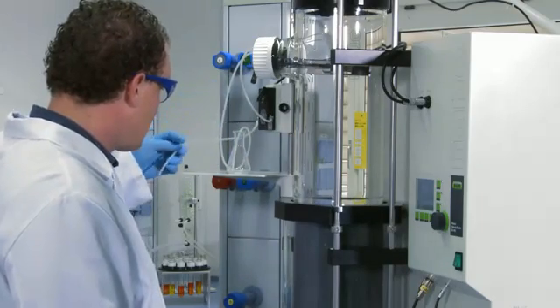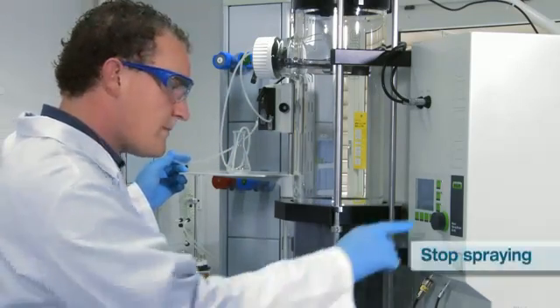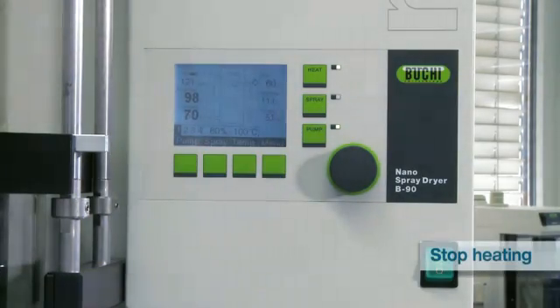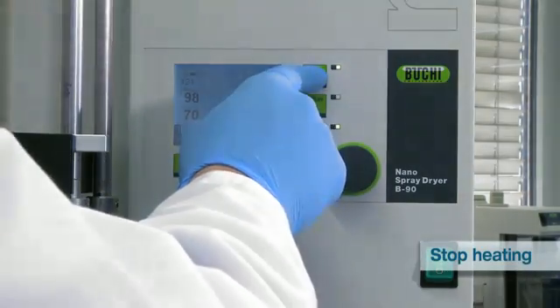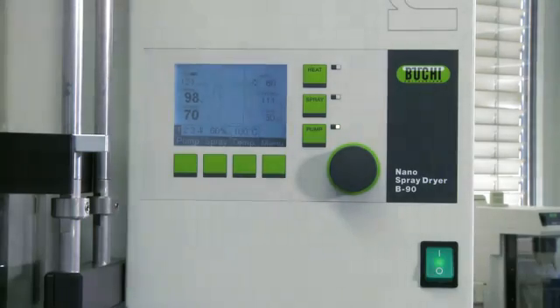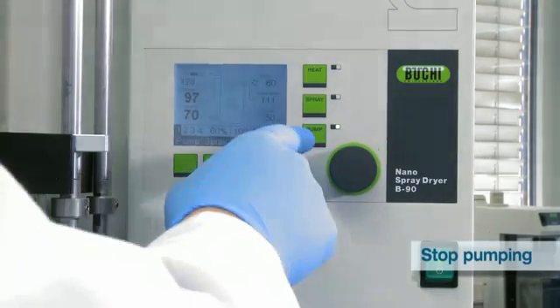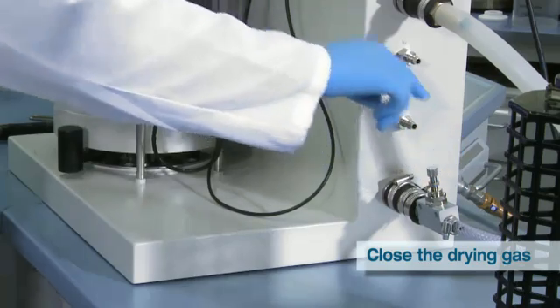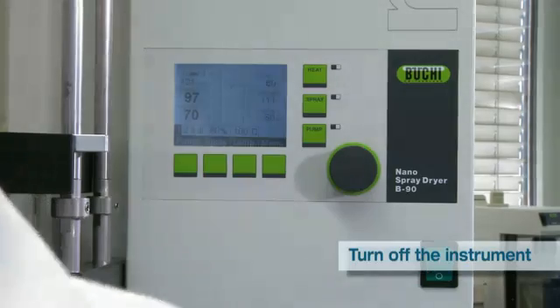Remove the inlet tube from the sample to empty out any residue from the tubing system. Switch off the spray head by pressing the spray button. Switch off the heater by pressing the heat button and switch off the pump by pressing the pump button. Finally, turn off the drying gas by closing the valve and turn off the instrument.